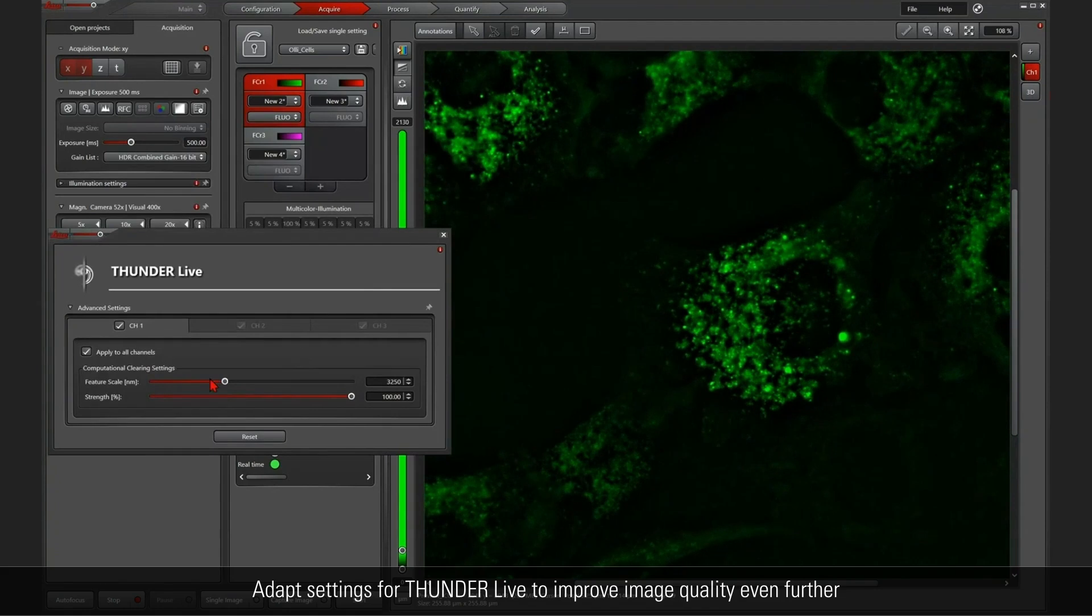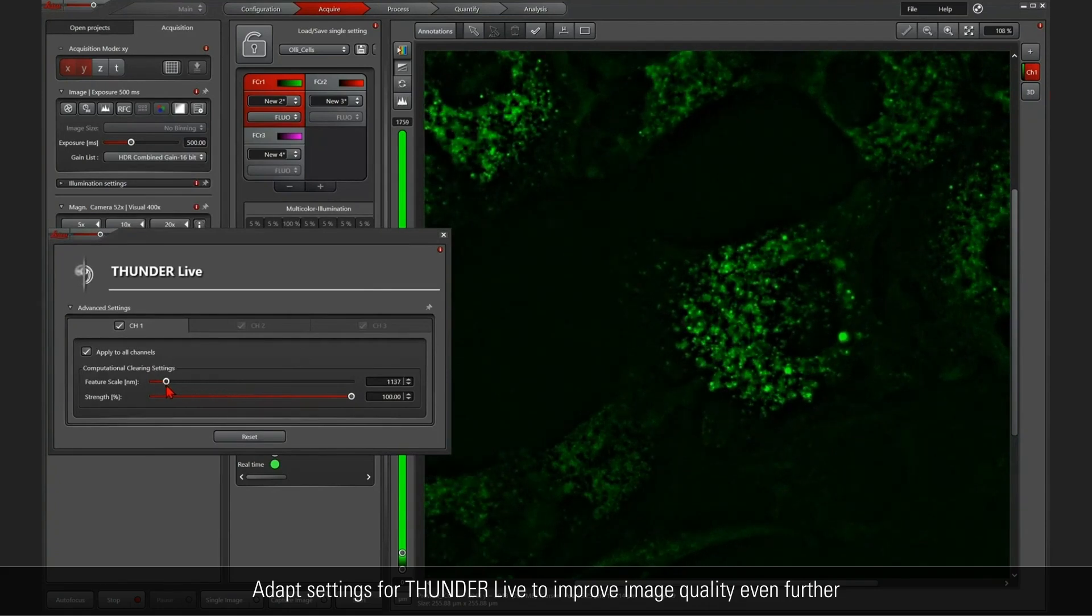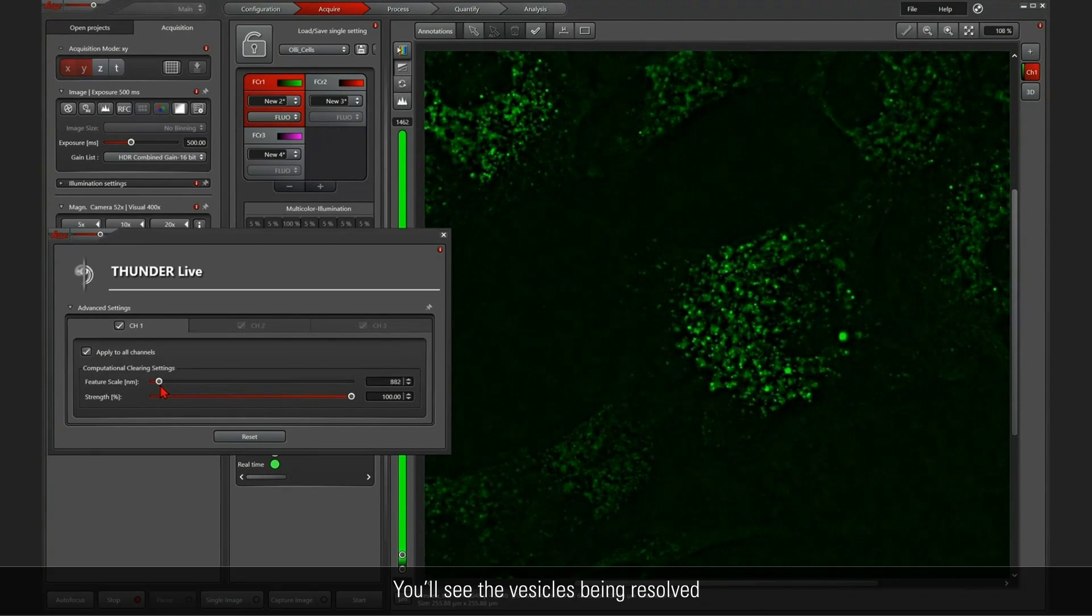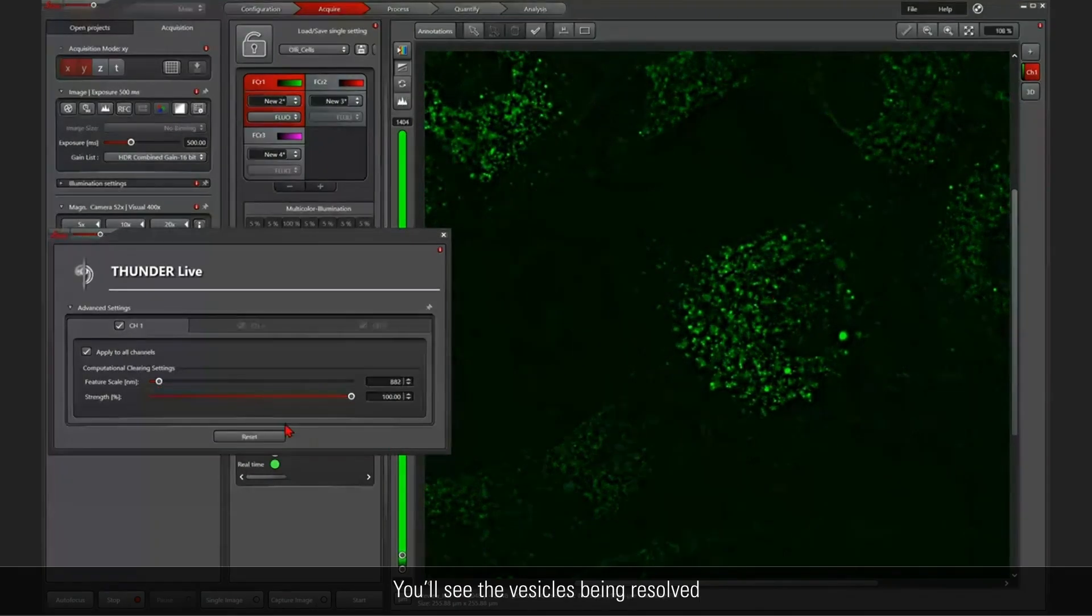So that's why I open up Thunder Live and I play around, for example, with the feature scale, until I see the vesicles being nicely resolved.